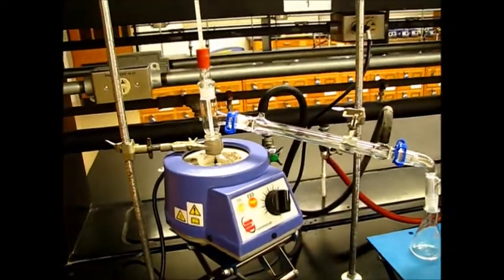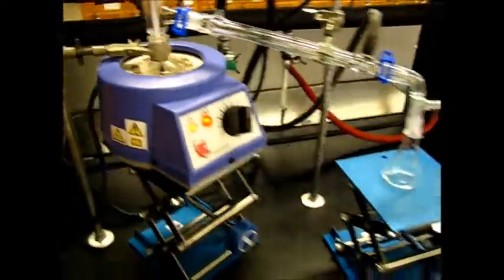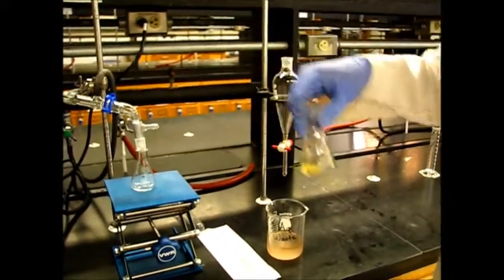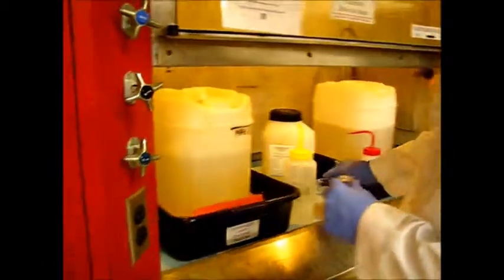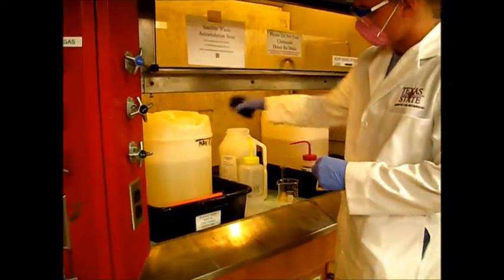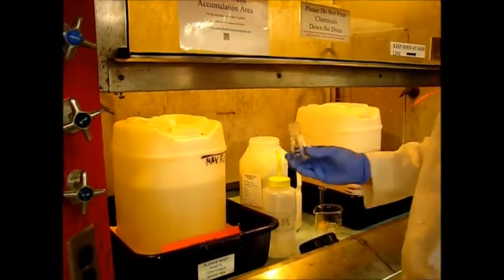So we have our distillation going now. While we're waiting for that to heat up and start boiling, we're going to start cleaning up just to save on time. So these were our washes from our separation. We're going to put these in the aqueous waste, and this is our sodium sulfate. We're going to put this in the solid waste. And then we're going to start cleaning up all of our glassware. Solid waste, and the aqueous will go into aqueous waste.